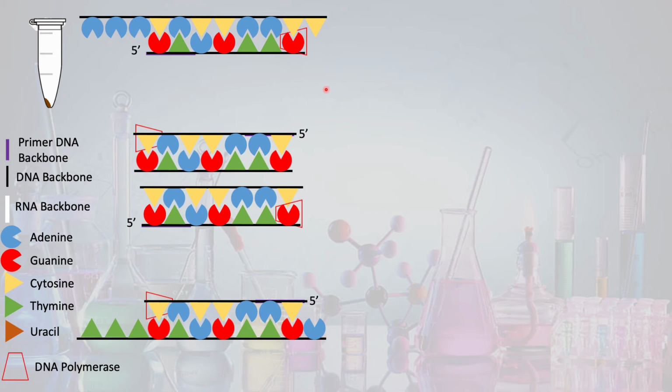And I described this earlier. So when we reverse transcribed our mRNA, that occurs in a 1-to-1 ratio when we generate our cDNA. So although this picture looks like we started with 1 copy of cDNA, right, from our 1 copy of mRNA, this is occurring on an order of magnitude reflective of however many transcripts of our mRNA that was present in our original sample. So if we started with 1, there would be 4 right now. If we started with 4, I think we would have 16 right now.